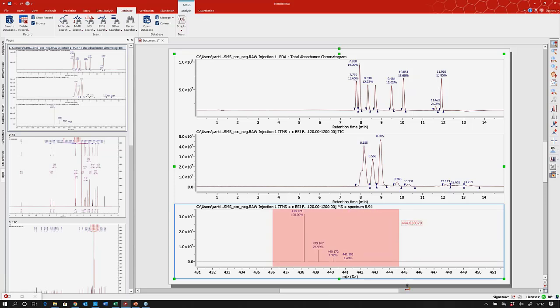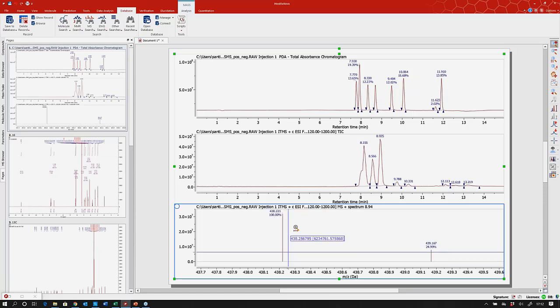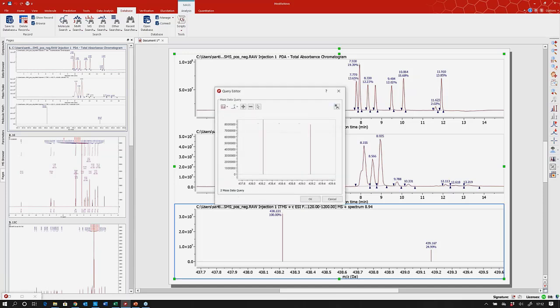the mass spectrum. So this is the isotopic cluster, but if I only want to search for the first 2 peaks, I can zoom into an area of the canvas which only has the first 2 peaks of the cluster. And now, if I again do a mass spec search, as we did before, you see that the query is only these 2 peaks now. So before I was matching the whole cluster with 4 or 5 peaks, or the whole MS spectrum, in fact. Now I'm matching just a couple of the peaks in the cluster, and that will be enough to give me a good hit.